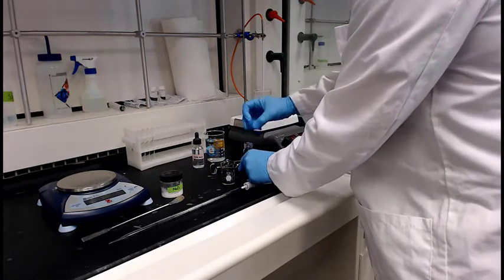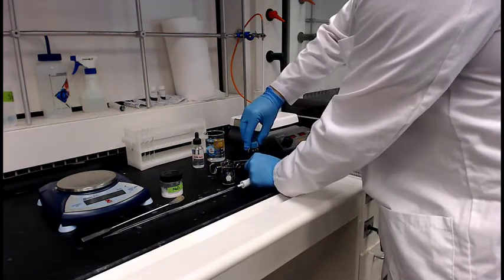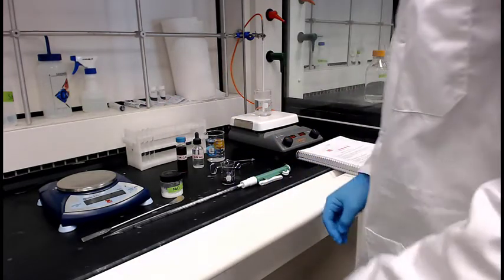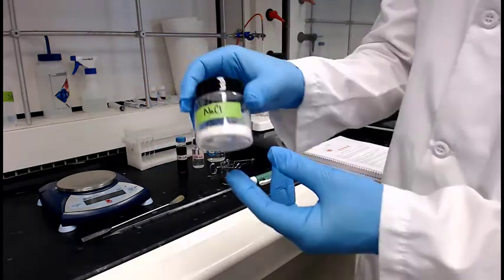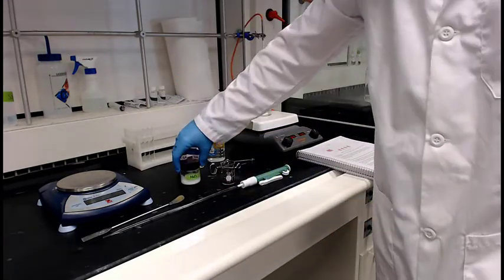I'm going to start adding sodium chloride to this. Right, step 2. Add 1 gram of sodium chloride to 5 mils of 1 molar CoCl2. There's your sodium chloride.